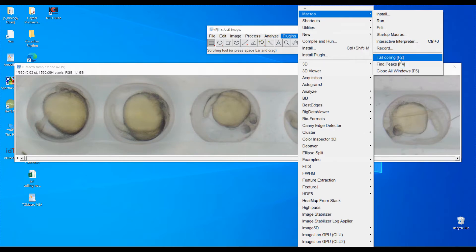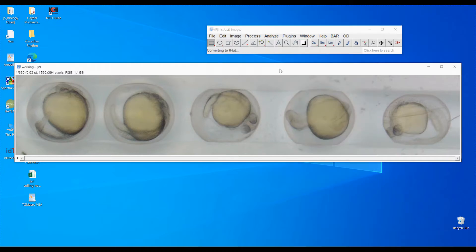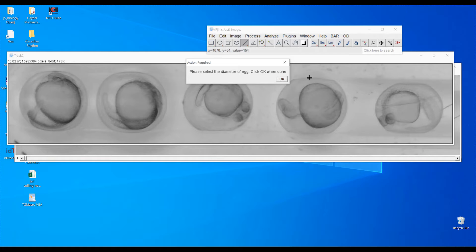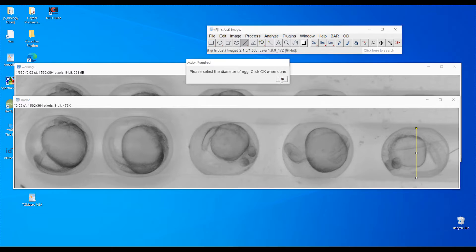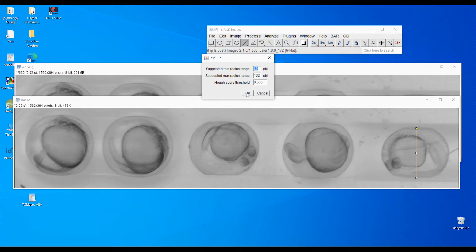The macro will first convert the video to 8-bit. After the video conversion is finished, you just need to select the diameter of one of the eggs. Here I give an example of a less circular egg compared to the others. We select the diameter of that egg and then click OK.